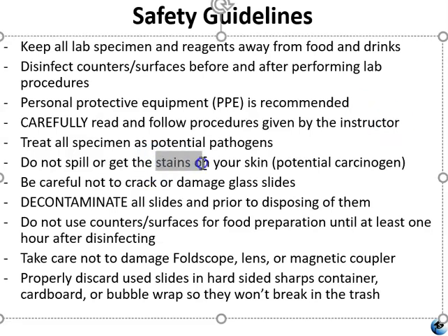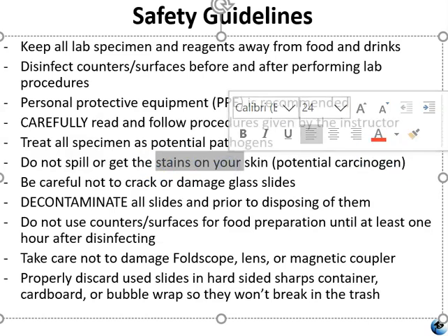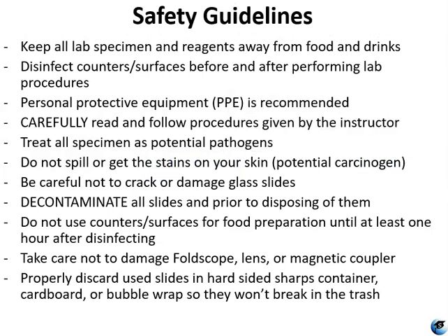Remember that those stains contain benzene. So you want to be very careful with them. You want to try not to spill them. Try not to get that stuff on your hands because benzene is a potential carcinogen, cancer-causing agent. Also, be careful with your glass slides. You don't want to break those, cut yourself.